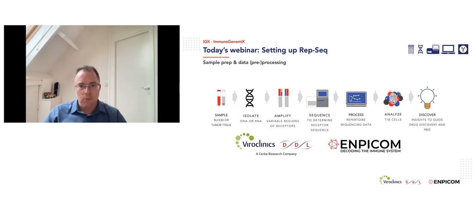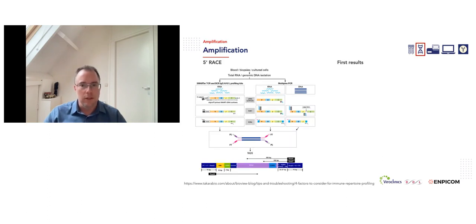In order to set this up, one of the first things we did, of course, is to look at, well, what specific components do we need? And in the end, we settled on an amplification kit by Takara. It's a 5' RACE kit.